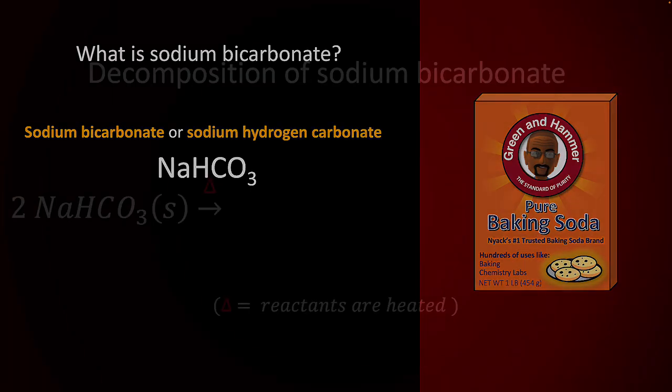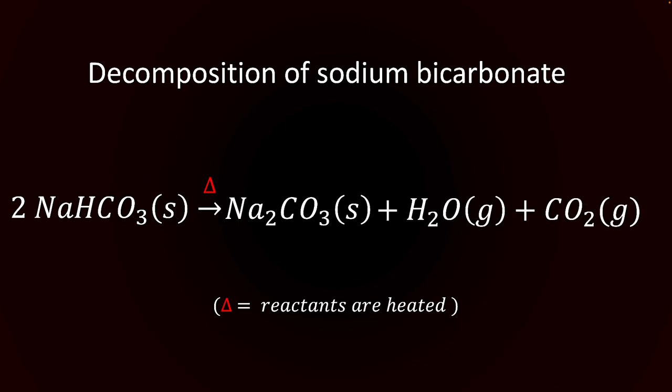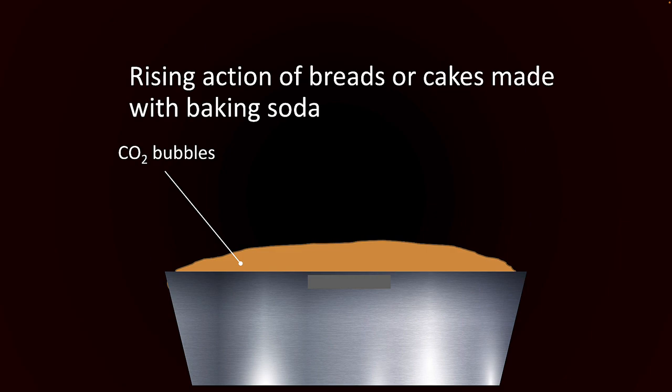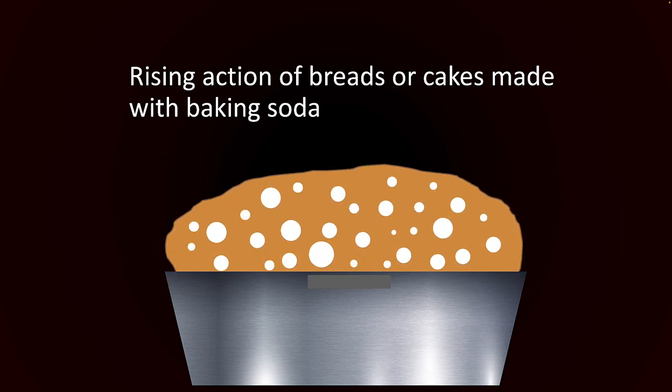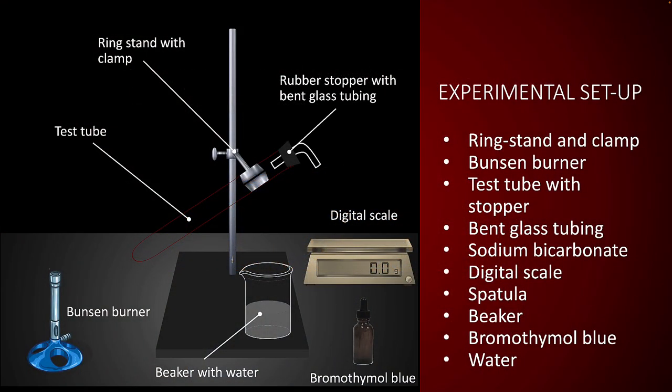soda. When sodium bicarbonate is heated, it decomposes into sodium carbonate, water, and carbon dioxide. The carbon dioxide produced in the decomposition is responsible for the rising action in certain baked goods. The setup for this experiment involves the items shown on the screen.